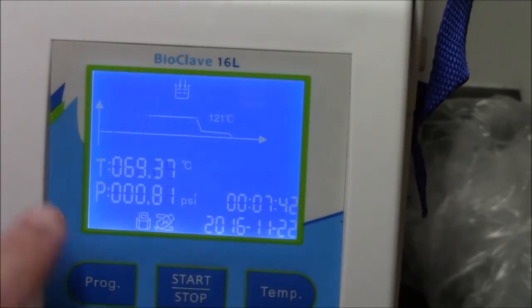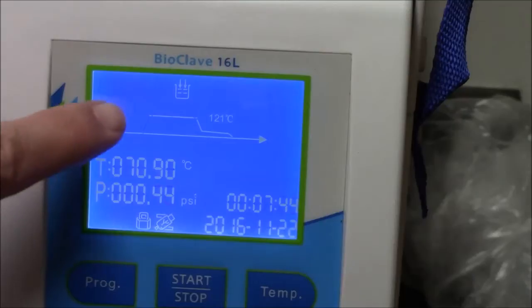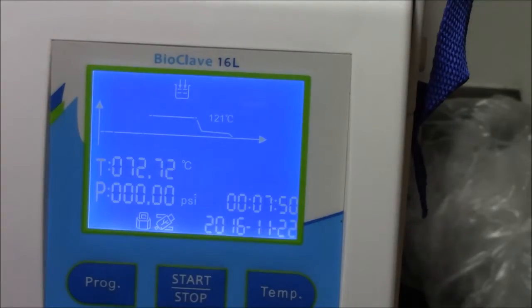About seven and a half minutes into the run. You can see the temperature is rising now. We're on this ramp and it's starting to pressurize the container inside by adding steam.